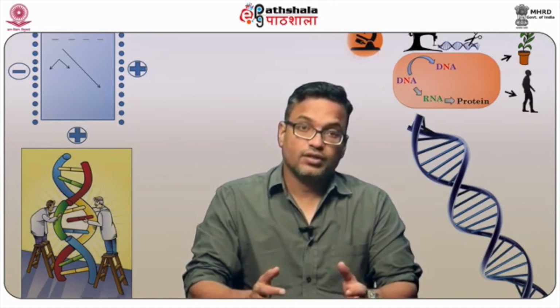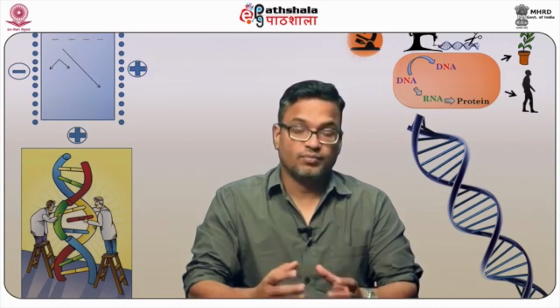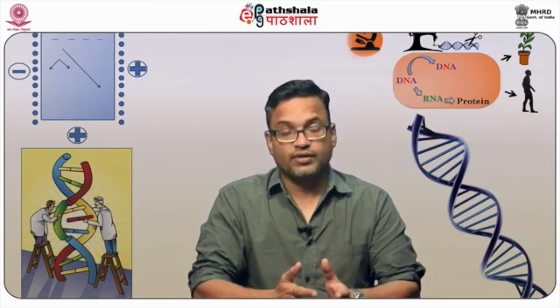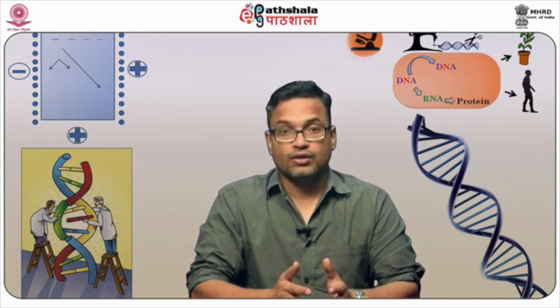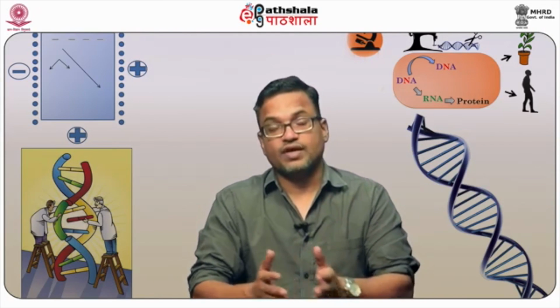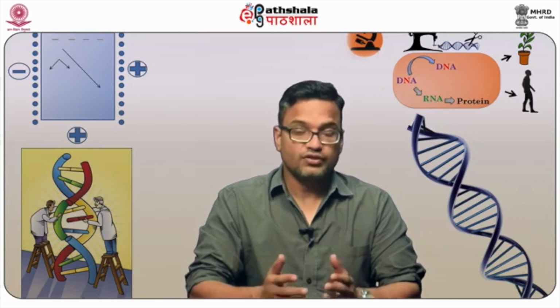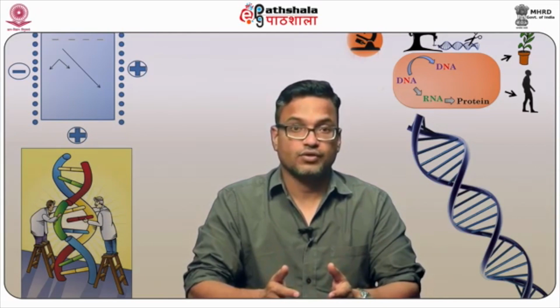The magnification and the resolution of a microscope remain the hallmark of microscopy imaging, because these two things have to be high, to be good in terms of addressing any questions, and they both depend upon the numerical aperture of the objective lens. So that is very important for microscopy.